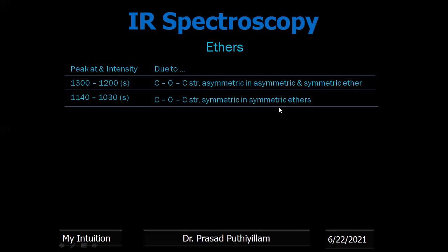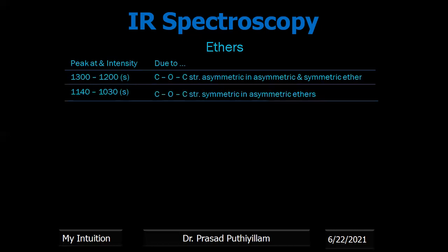Okay, so you might have seen that strong peaks are obtained, but this type of peak is given by many other functional groups. Therefore, if we have taken pure ether, and it is not influenced by other functional groups, then this peak we can identify. Otherwise, in the same range, many other functional groups also give a strong absorption peak. So therefore, ethers are always somewhat difficult to analyze with IR spectroscopy, but still the expected peaks are given here.